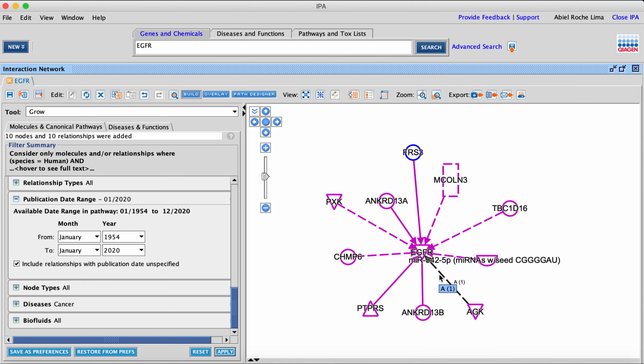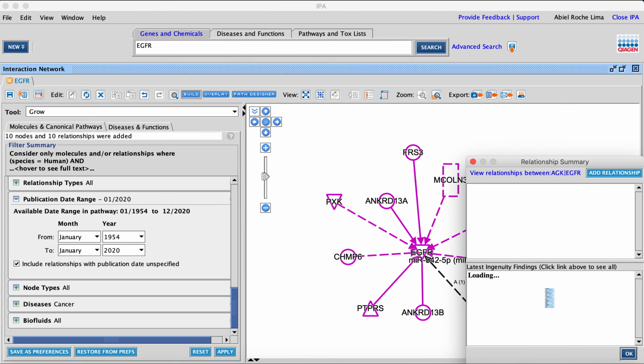So we can double click this annotation in here, and all these nodes, as it shows, are data points, are proteins or genes that are connected between them. And the lines are called the edges.